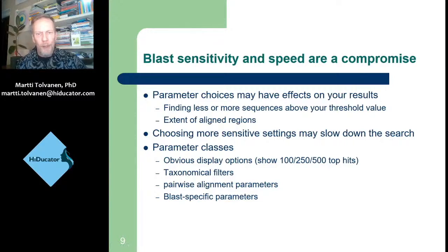You saw the magic happening in the demo so that I had the results immediately, but I confess I was cheating. They were run beforehand with the same parameters, and then I just recorded how to set the run to start and jumped into my second window where the results were waiting. In fact, it would take a minute or several minutes, and with slower parameters it might take like 5 or 10 minutes. But anyway, let's start looking at these things.